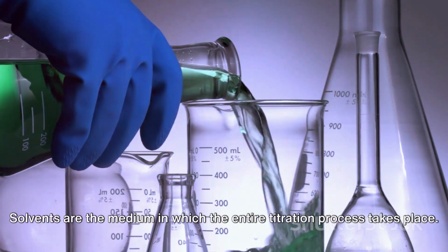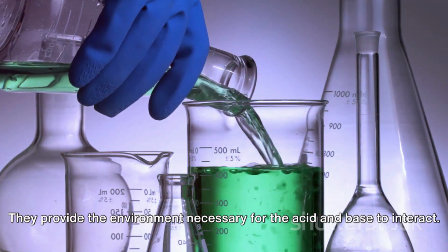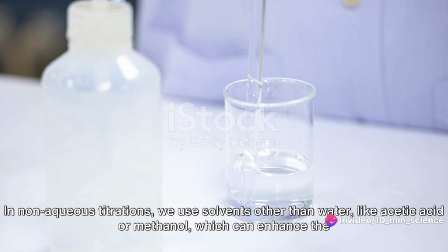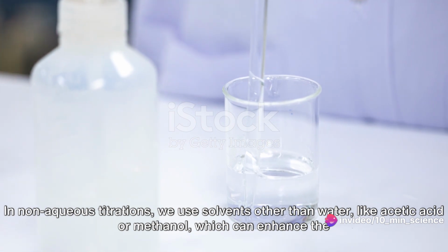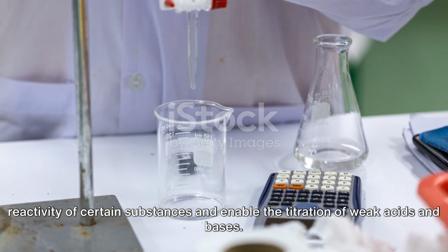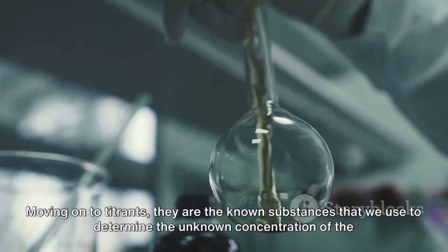Solvents are the medium in which the entire titration process takes place. They provide the environment necessary for the acid and base to interact. In non-aqueous titrations, we use solvents other than water, like acetic acid or methanol, which can enhance the reactivity of certain substances and enable the titration of weak acids and bases.